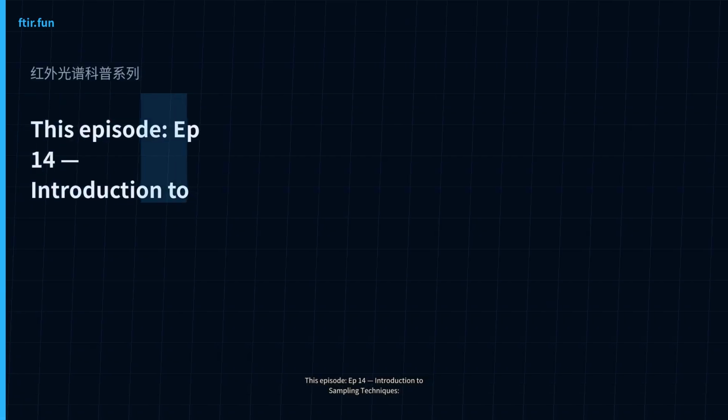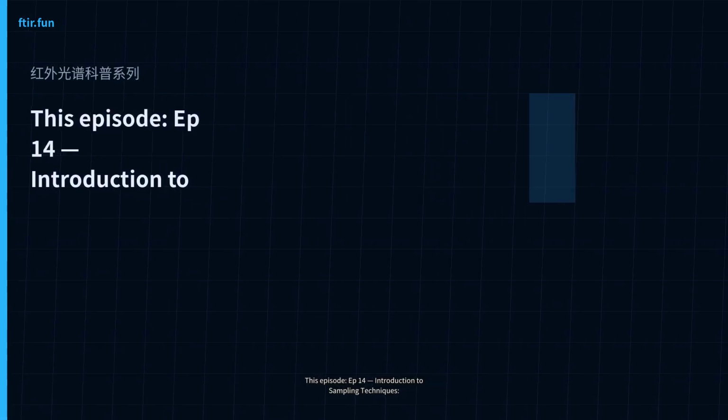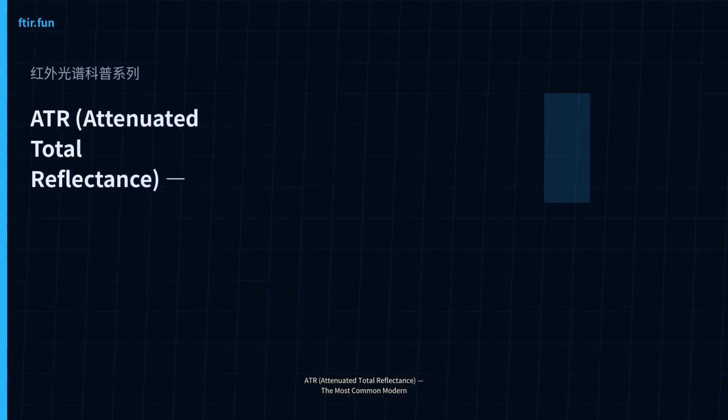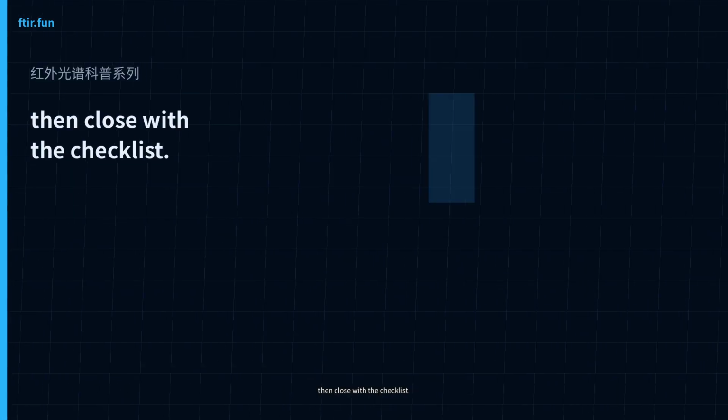This episode, Ep14, Introduction to Sampling Techniques. A. Attenuated total reflectance, the most common modern technique. Then close with a checklist.